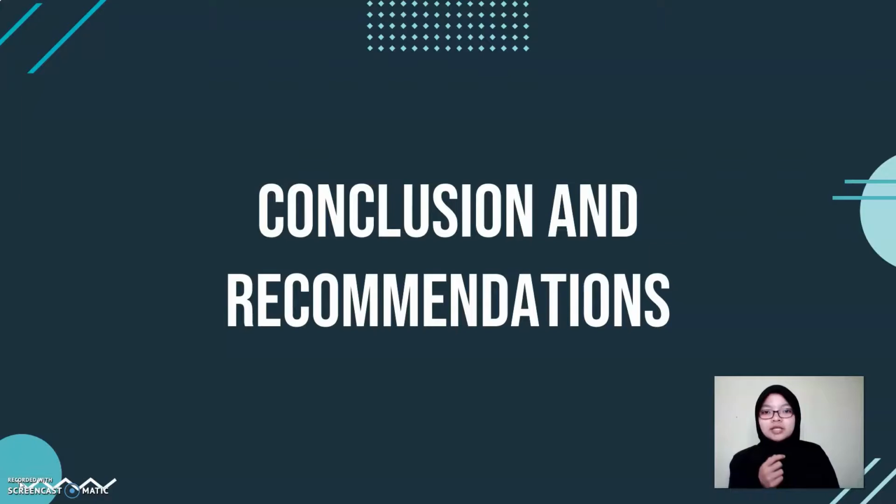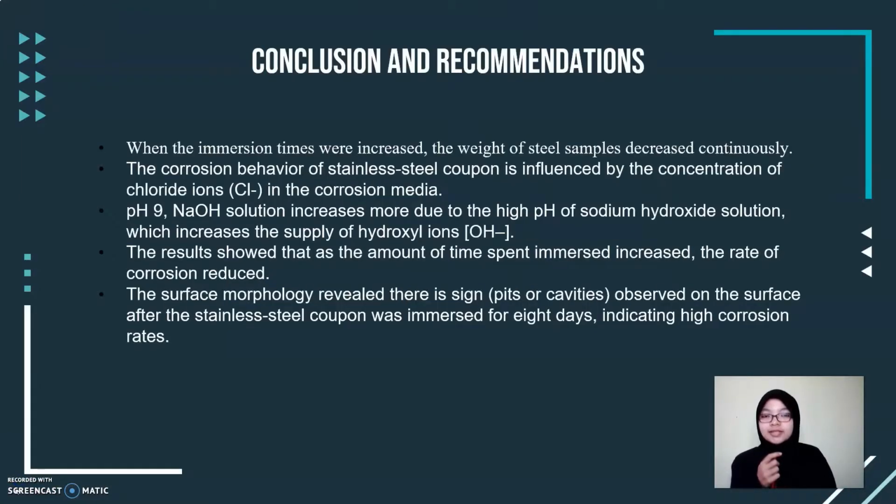Last chapter, which is conclusion and recommendations. When the immersion times were increased, the weight of steel samples decreased continuously. The corrosion behavior of stainless steel coupon is influenced by the concentration of chloride ion, Cl-, in the corrosion media. The weight loss in pH 9 NaOH solution increases more due to the high pH of sodium hydroxide solutions, which increases the supply of hydroxyl ions.